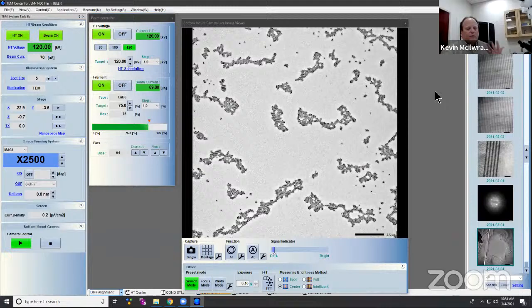So let's look, now cameras, we went through the whole thing of taking a background, right? This background looks good. We took it on the last sample of just an open area, right? You can't take an image of a background with anything in it because that becomes part of the background. So we did that already. So I aligned the tool kind of yesterday.